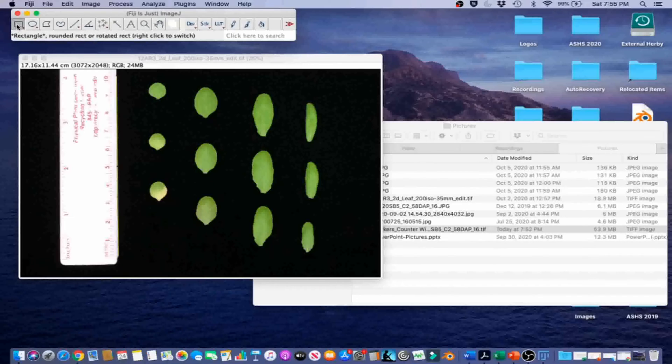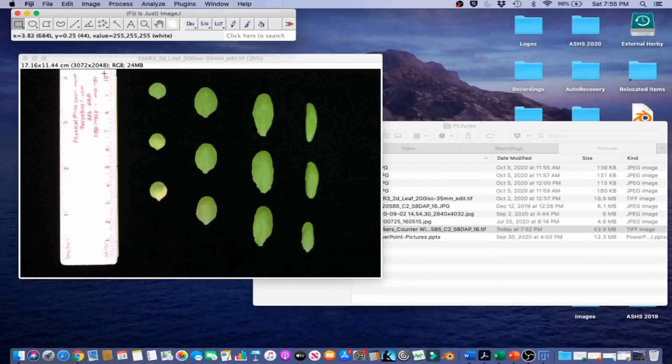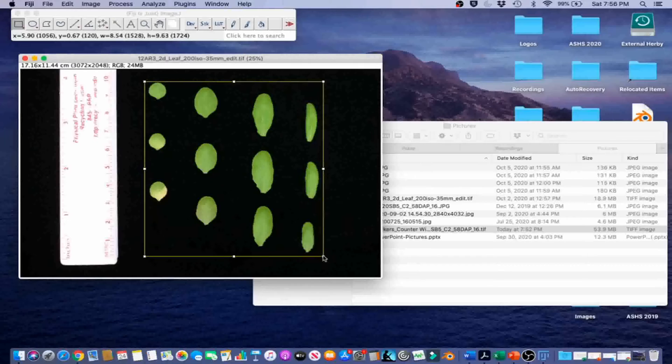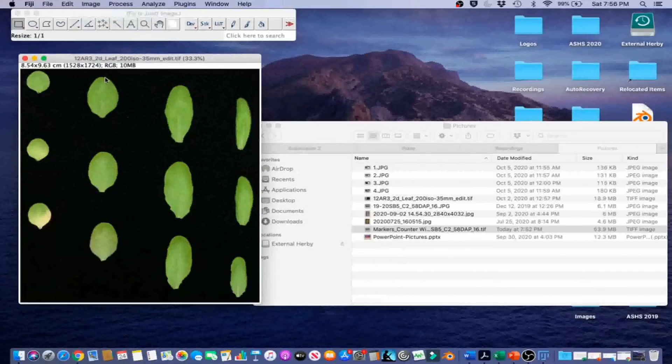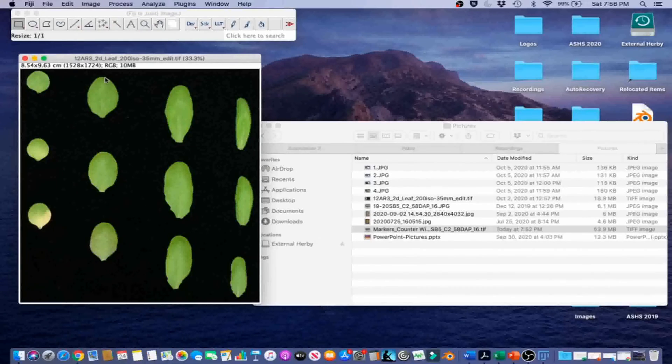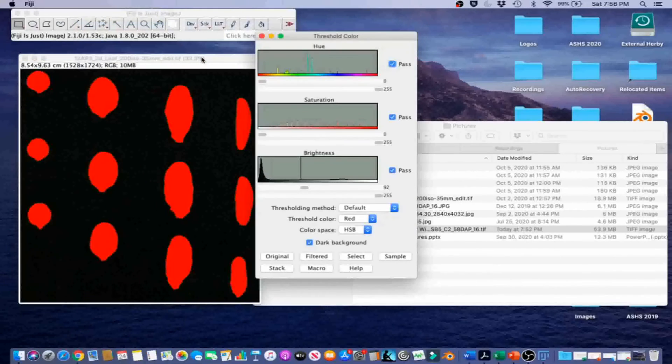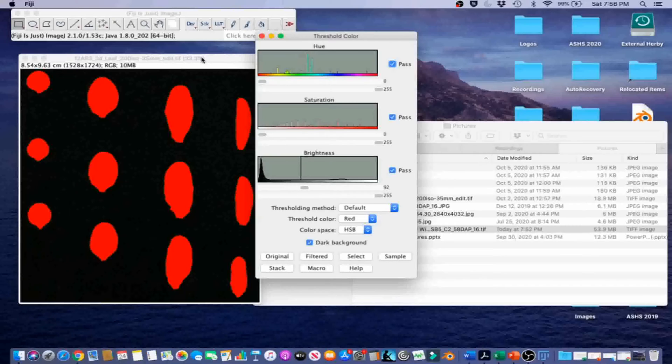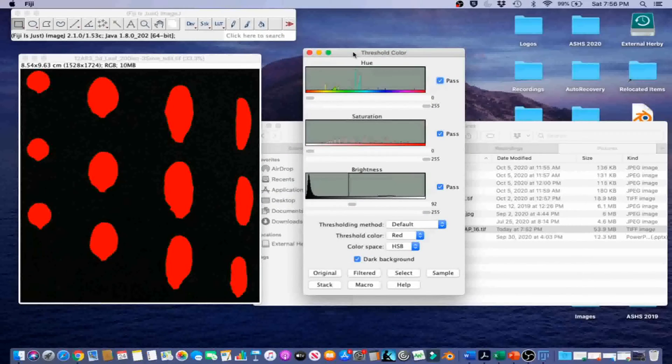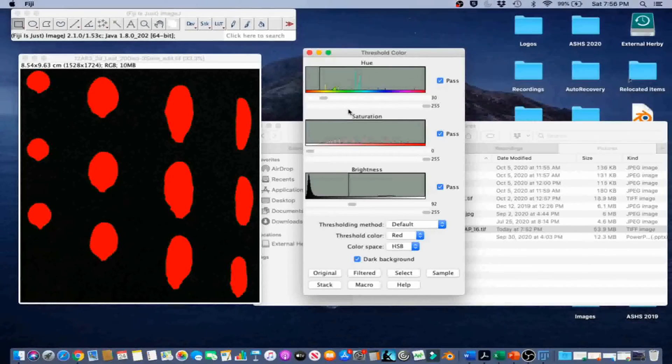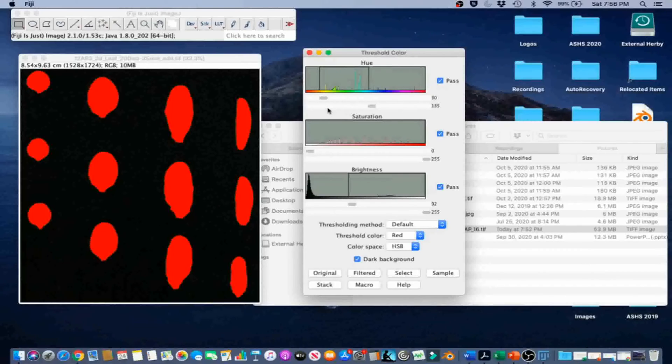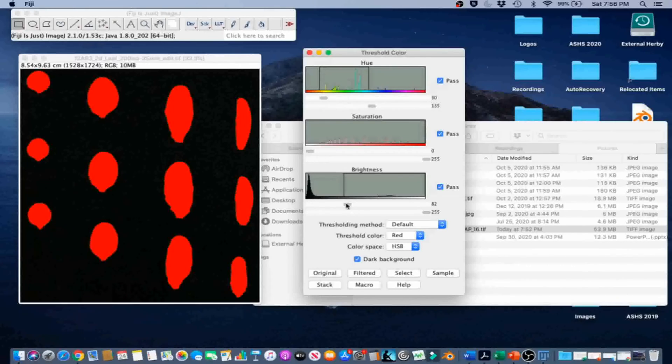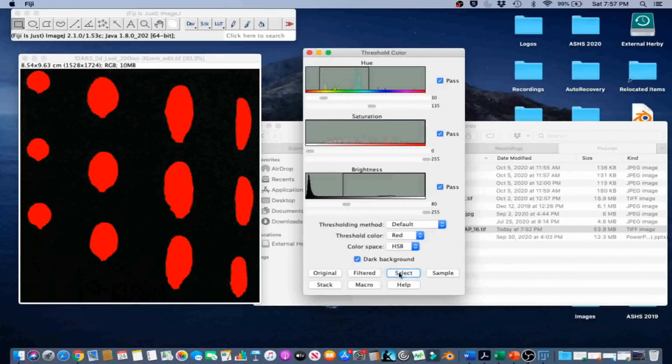Go ahead and click on the Rectangle tool and select the smallest rectangle around the leaves. Then we're going to go to Image and Crop. Then we're going to go to Image, Adjust, Color Threshold. And we're going to select the leaf area by thresholding. In this image, we're going to need Hue between 30 and 135. We're going to need Saturation between 0 and 255. And then we're going to need Brightness between 80 and 255. And then we're going to go ahead and click Select.